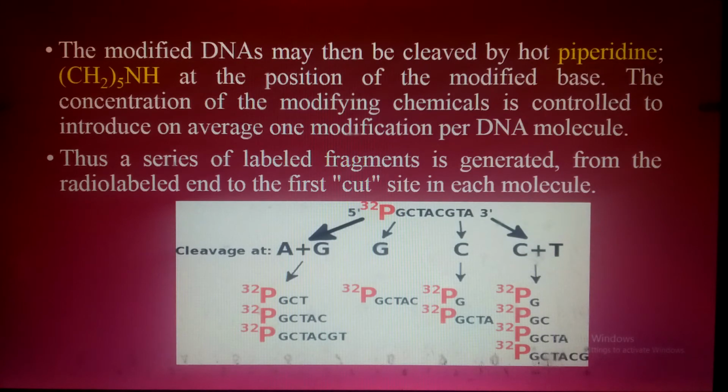Like dideoxy in the Sanger method, where Sanger used dideoxy to terminate DNA elongation. Here, what will happen?